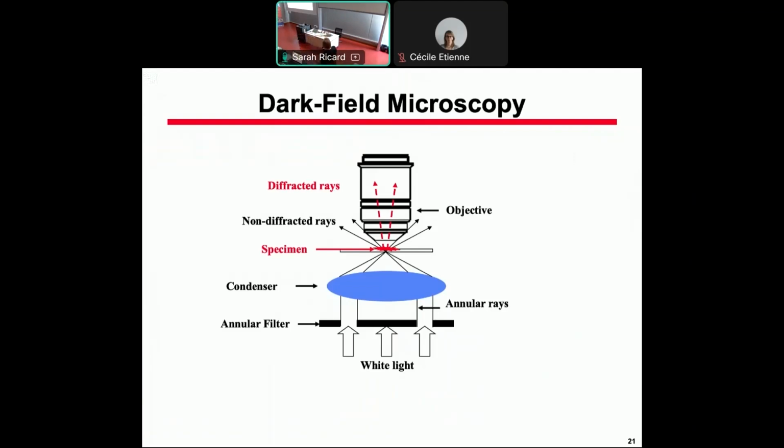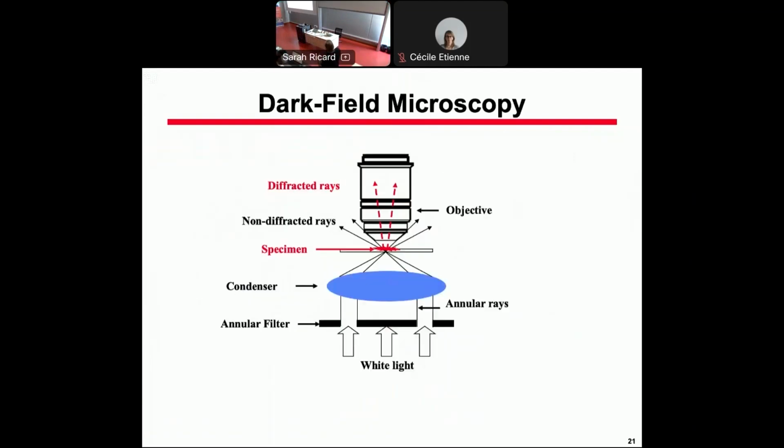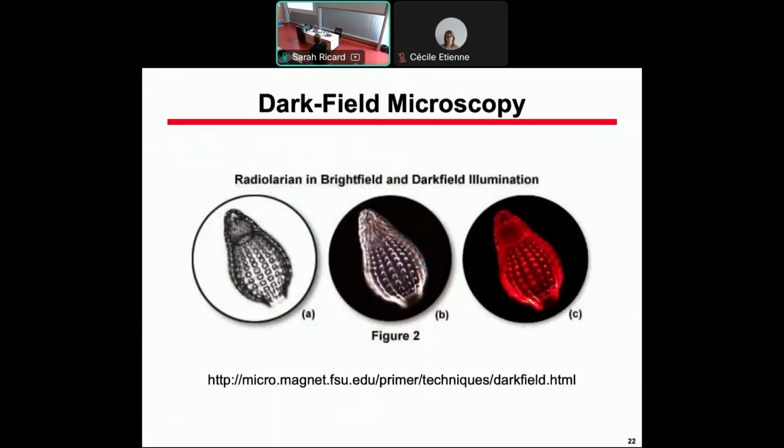That microscope is very interesting because it shows that pure ray tracing cannot form an image. It's diffraction which makes images. Because here we have no sample, so no diffraction, so no rays enter the objective, so there is no image. So the diffraction theory of image formation applies. Okay, dark field microscopy is well known.